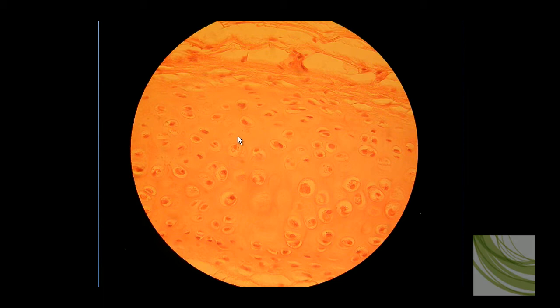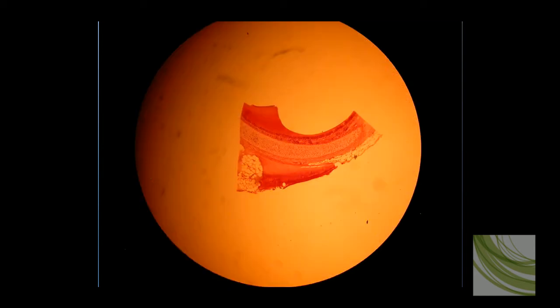What's really apparent here is we don't see any fibers. The area between the lacuna is very smooth and polished looking. There are no fibers evident, and that's really your best indicator that you're looking at hyaline cartilage. We're going to look at another slide at both 4, 10, and 40X for comparison, and even though the slides look quite a bit different, we can still look for this one characteristic: medium-sized lacuna with smooth matrix between them and no fibers.